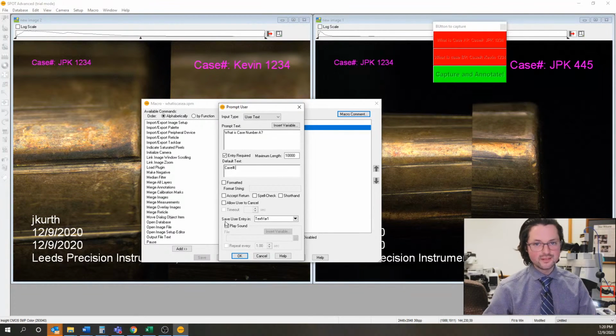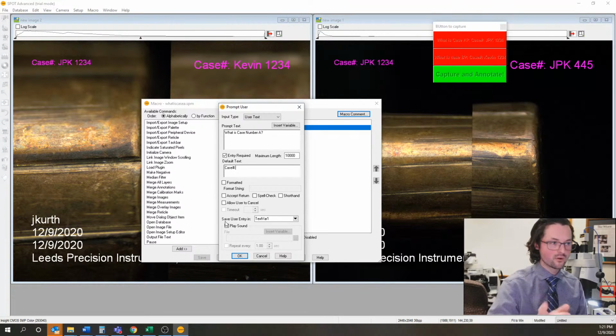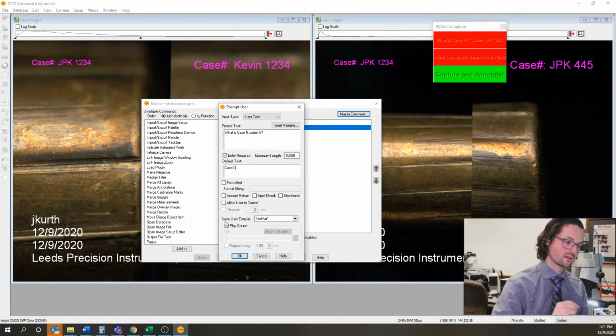Again, you can get into the weeds. The second you start talking about macros, you really get into the weeds. But hopefully this helpful tip video will show just how to set up these macros. Bear with me, we're about 2 minutes away. I'm going to show you one last tip or trick on how to set this up.